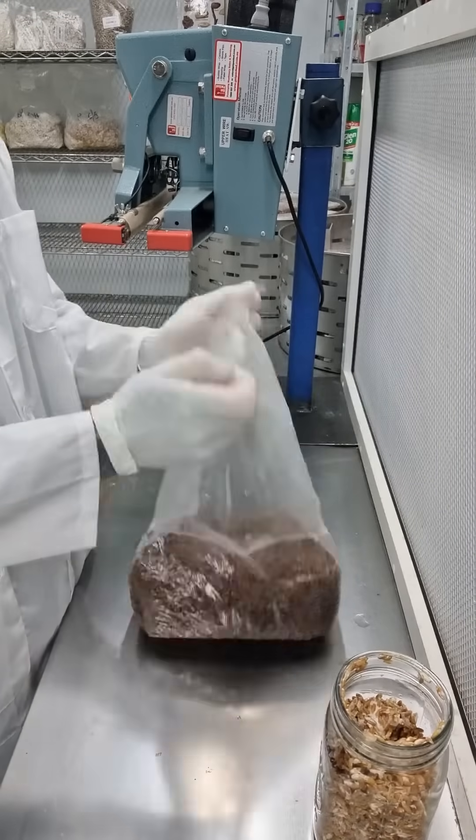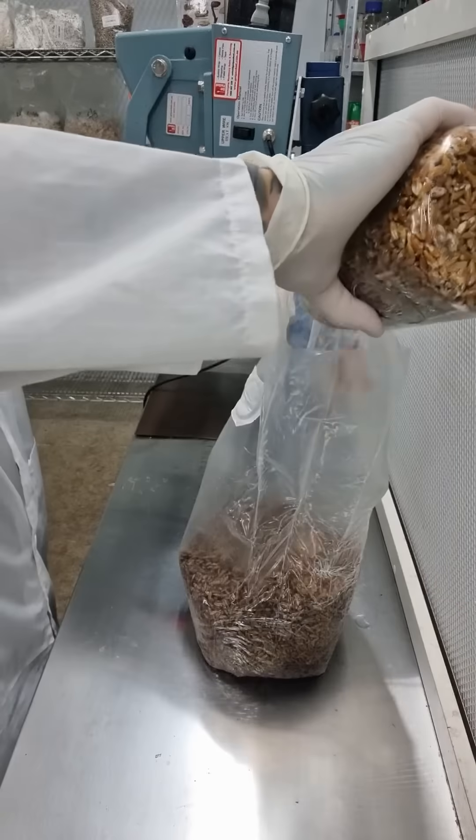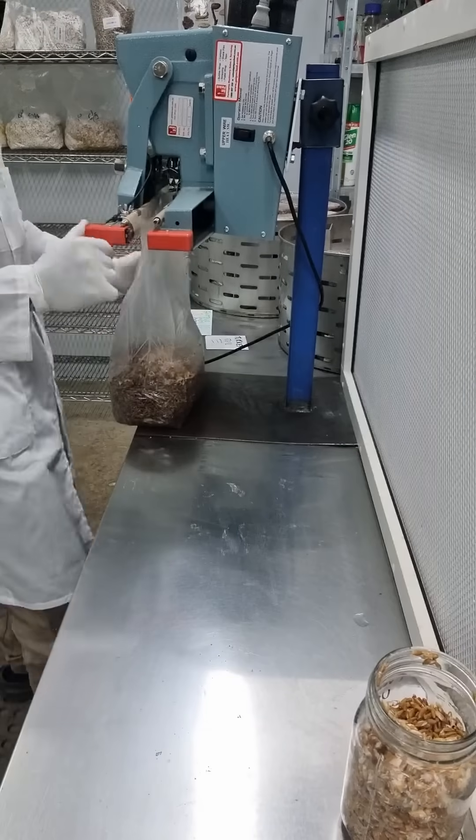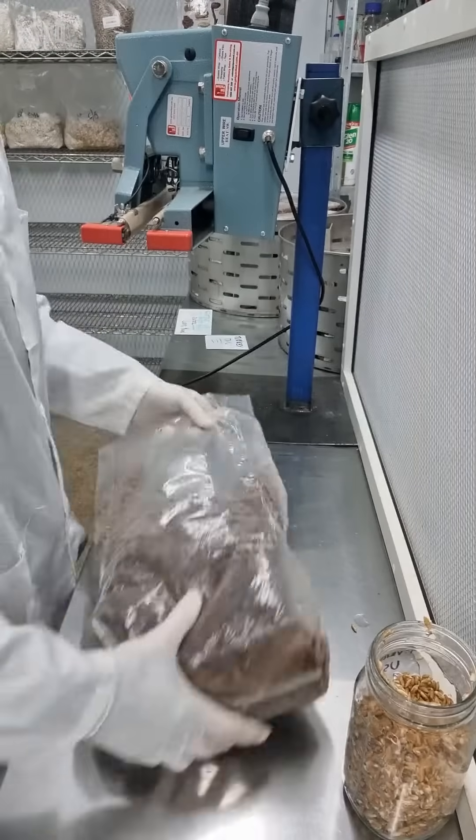This is a technique known as a grain-to-grain transfer — we're using the master to inoculate the larger bags of spawn. They get sealed up and sent off into incubation, and once they're fully colonized we can use them to inoculate our substrate.